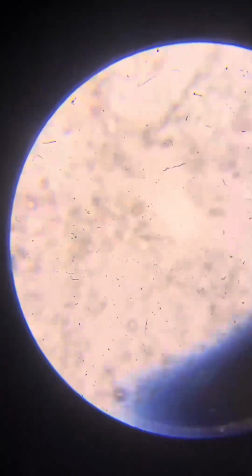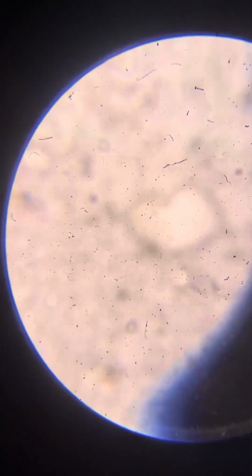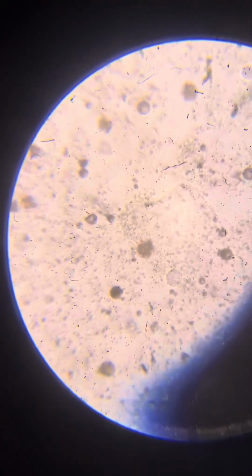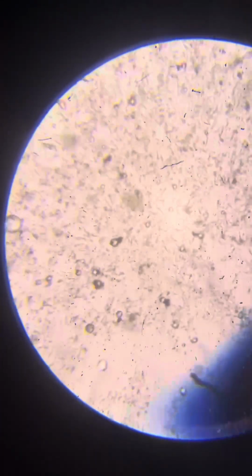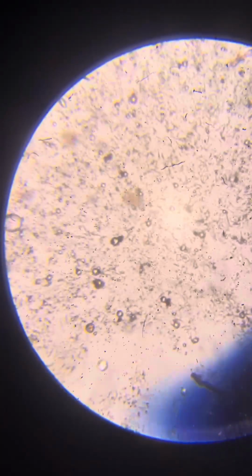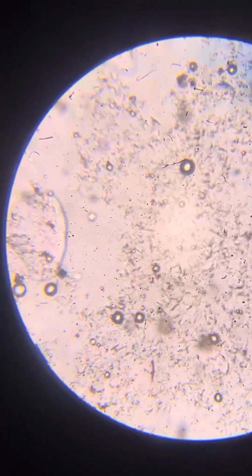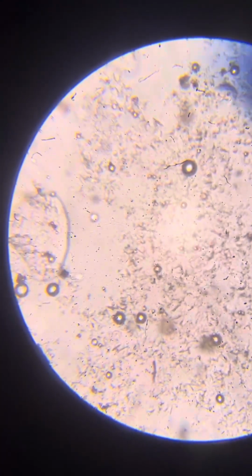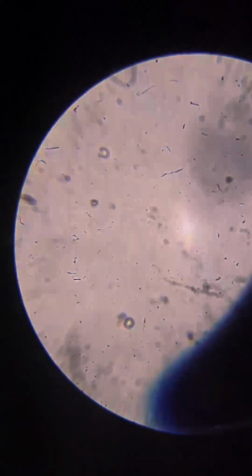Okay, not much. We see a good assortment. No surprises. We don't see life forms. We don't see anything that is special. It's not a huge assortment, but it's a reasonable assortment and it's consistent throughout the slide, the sample, and so it's good. It's fine. It's not amazing, but we didn't expect any result because of the nature of the experiments and how it was created.